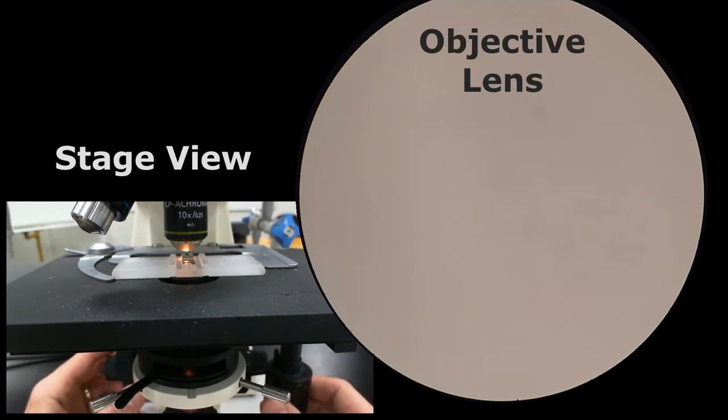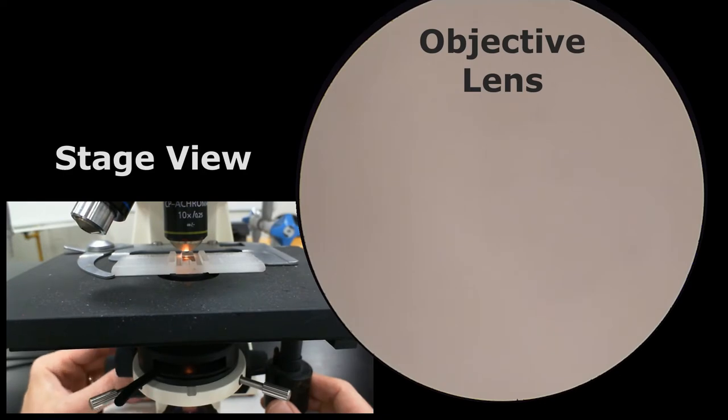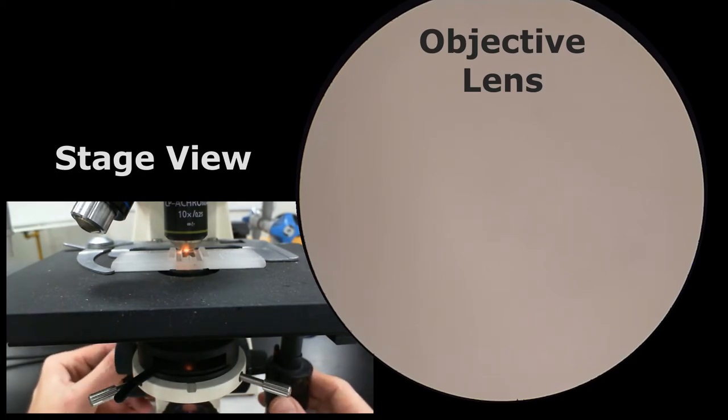So we're going to use the coarse focus and bring the stage up as far as we can. I'm going to get my head down next to the stage so I can see how close we get. We don't want to get too close. So it's as close as I'm willing to go right now. Let's see if I can get this to focus now in the other direction. So I'm going to move the stage downwards. Okay, and so I'm going to start focusing. See if I can get anything into focus.